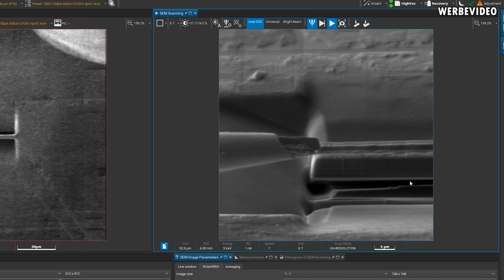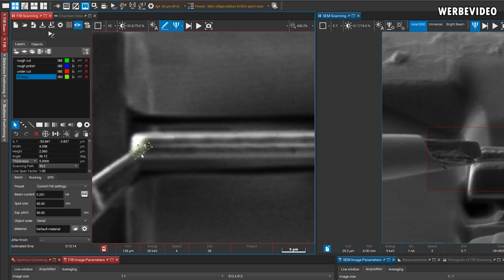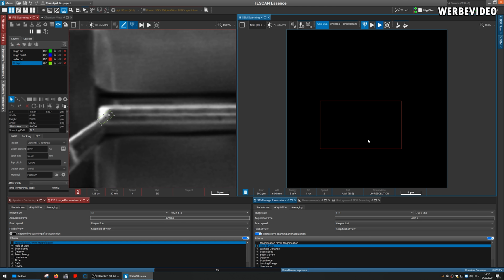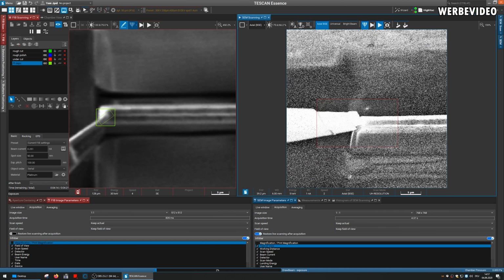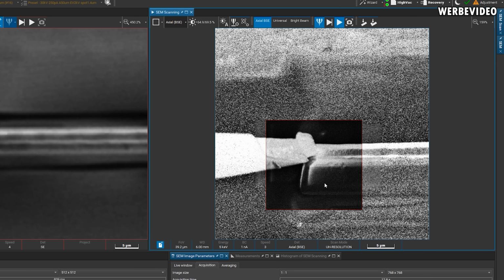At this point, also always keep in mind how tiny everything is right here. Again, the lamella has only a length of about 0.1 millimeter, and just being able to place this needle so closely and precisely to this lamella is already mind-blowing. Once the needle is at the right position, we again have gas running across this area, and once it's hitting the ion beam, we will have platinum on top.